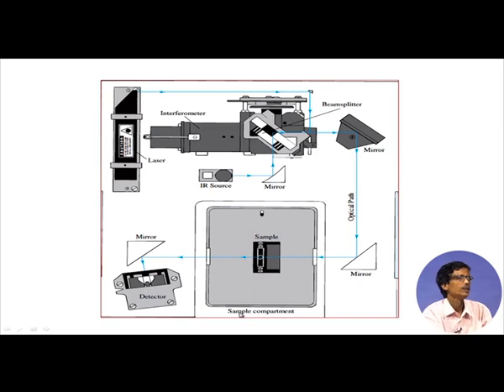So, that is why we talked about so many optical materials which are IR sensitive. So, there should not be any IR absorption like the different salts like potassium bromide or any other inorganic salt. So, when it is finally guided to this sample compartment, this is our basic sample compartment. So, you have this transparent window and here also the exit window.